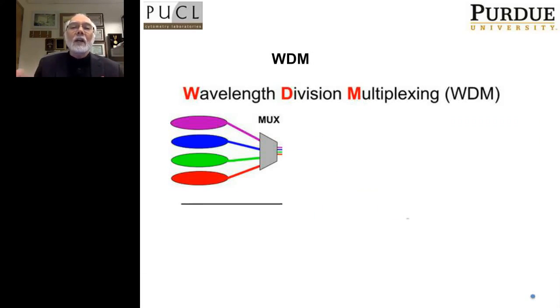So if we look at what's actually happening from a light management perspective in a flow cytometer, in fact in the CytoFLEX, what I've shown up here are a bunch of colors indicating different wavelengths, perhaps of fluorochromes, and they're going to a little box.